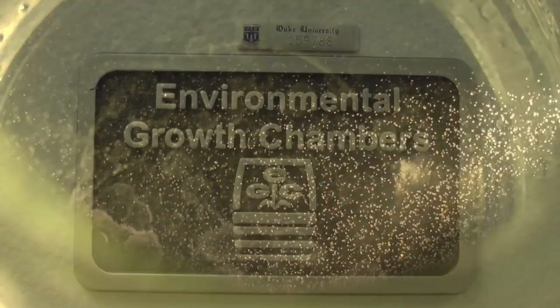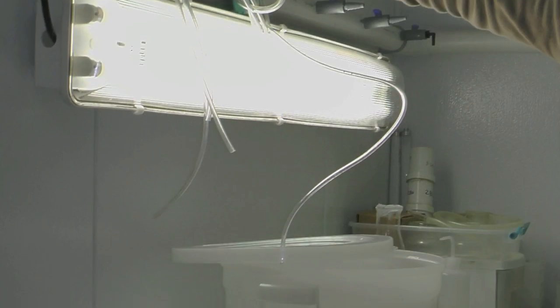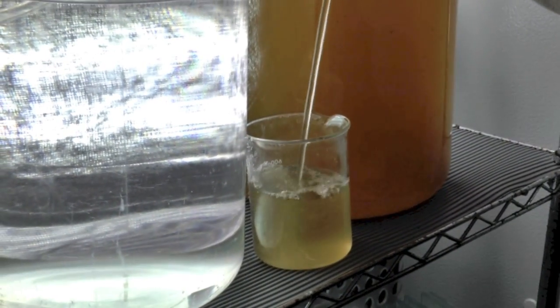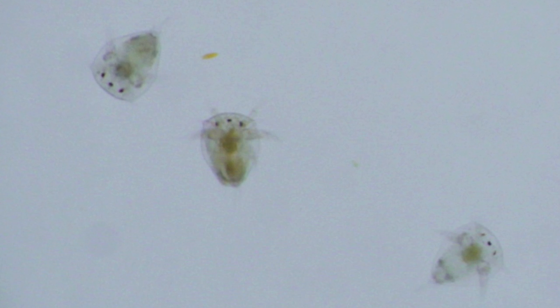Once a sufficient amount of larvae is collected, they will be cultured at 28 degrees Celsius for 4 days. The larvae are fed 500 milliliters of brown algae every day, which is good food for the larvae, or green algae as an alternative. They grow through 6 larval stages to the cyprid stage, and just before the cyprid stage, they have 3 eyes.